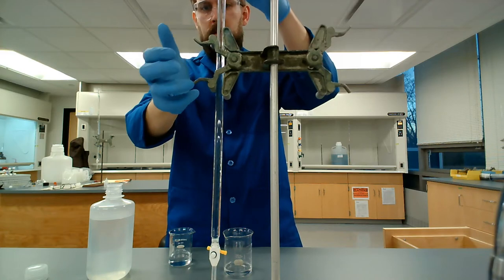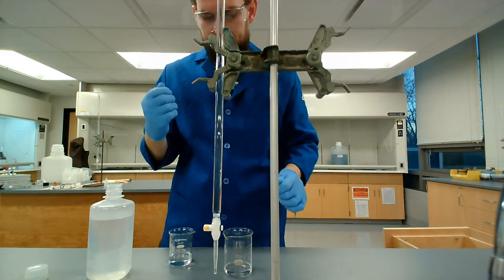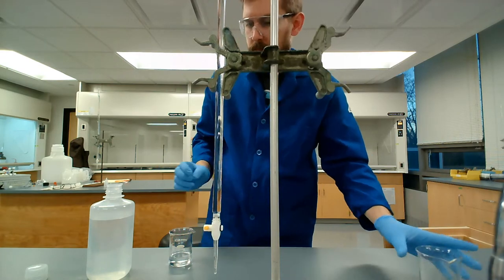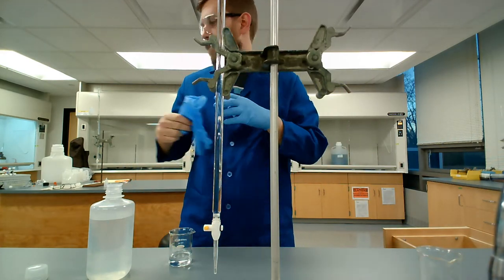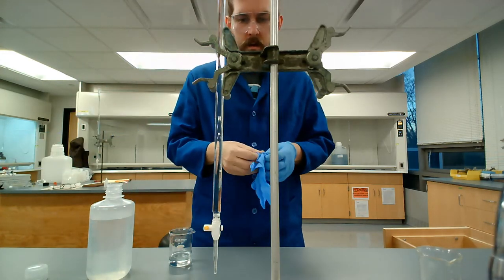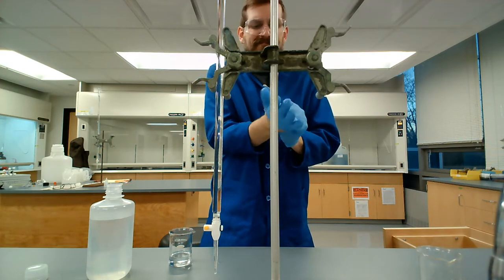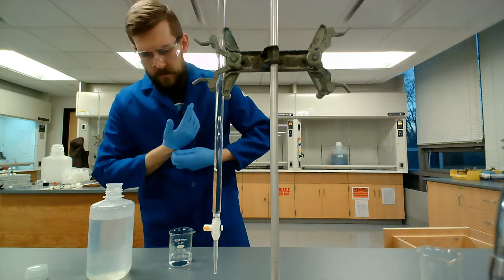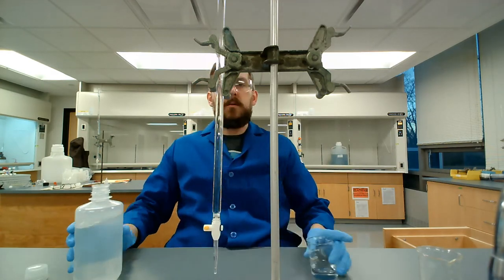So a lot of the prep in a titration has to do with getting your buret set up: make sure it drains properly, make sure you've rinsed and conditioned it with the solution you want to put into it. I'm going to take my glove off because it had a little bit of sodium hydroxide where I capped the thing with my thumb. And you don't have to use a glove. You could use a rubber stopper to cap the buret. You just don't want to use your exposed hand, right? Getting sodium hydroxide on your hand is never really a good thing. So.